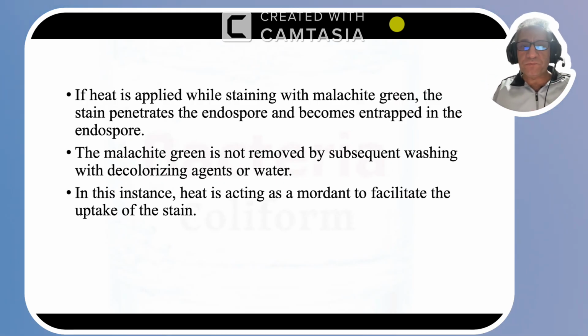And the other cells will stay red. I mean, they will not keep the malachite green, and they will take the last stain, which is safranin in our test.